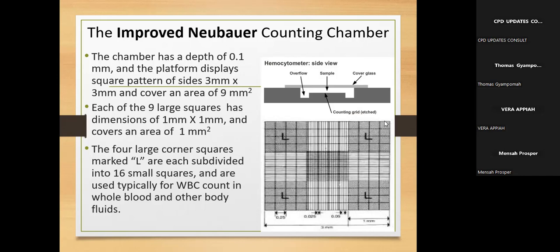And therefore you can calculate the area here. One smaller square of the small square areas, you can calculate it. That's 0.25 multiplied by another 0.25. Okay, so you can do that. Now, if you come here, this is very, very interesting. Let's go back here. So here, divided into 16 squares, 4 here, 4 here. Let's give the 16 squares.